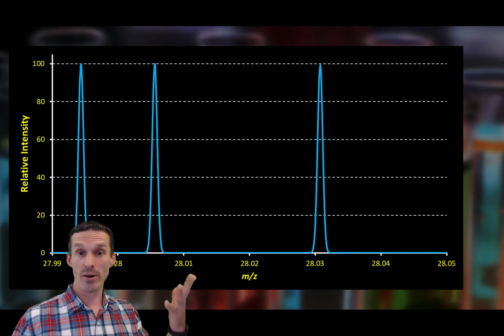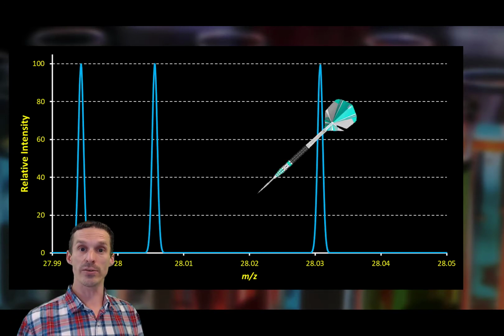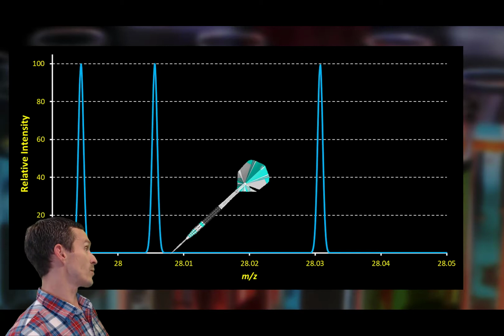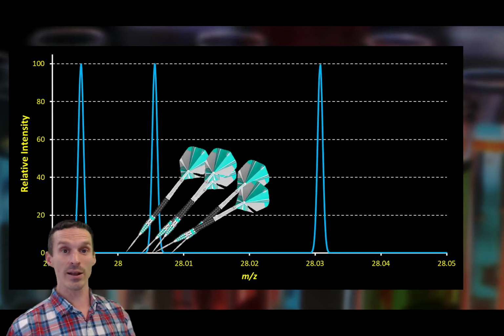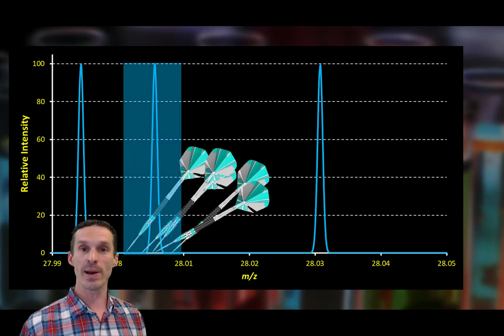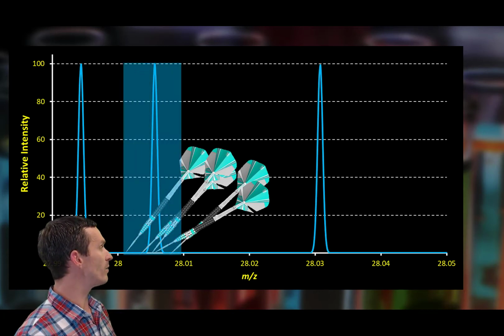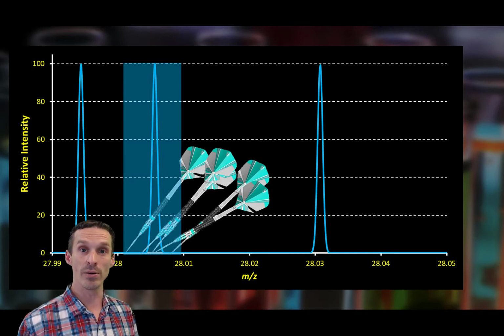So let's say now I've sort of traded up. I'm using a mass spectrometer that has much higher mass accuracy, and this time we get this measurement, but the next time we measure it and the next time, it all lands down to the same spot. If you were to have an instrument that has that degree of mass accuracy, I think you could confidently say that you must have pinpointed onto this particular unknown.